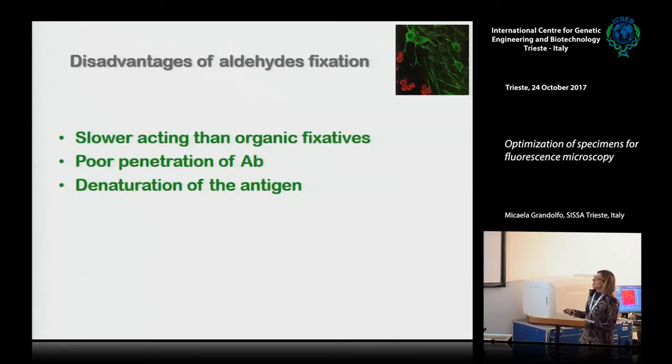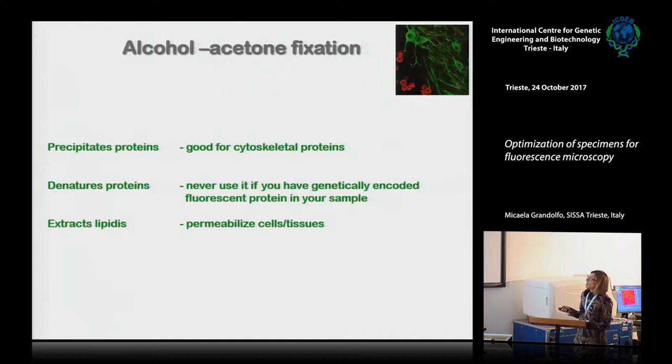Okay. Some disadvantages of the aldehyde fixation. They are slower than organic fixative. Sometimes there is a poor penetration of antibodies due to the cross-linking, and sometimes you can face the denaturation of the antigen. Okay, let's move to the alcohol acetone fixation.